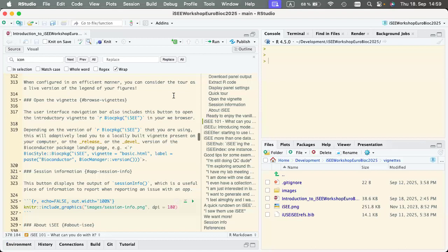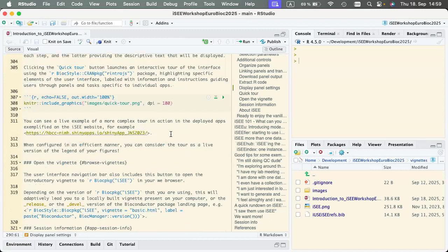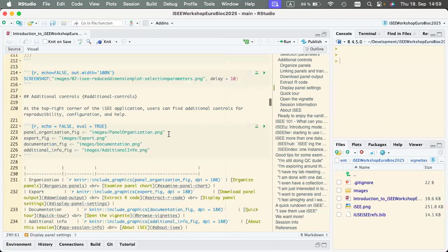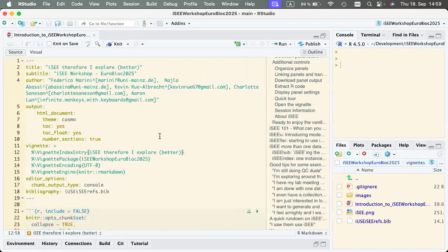I don't know if it is readable at all from the bottom lines. I cannot control too much what the Beamer is giving me. I can try to maximize it like this. You can use Control plus. Yeah, I can, but it will get possibly too large.